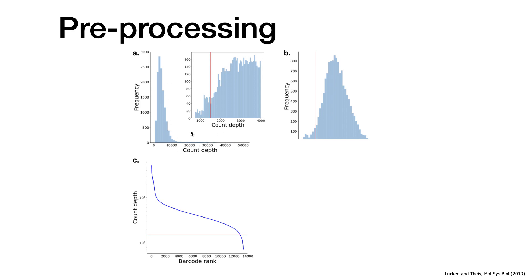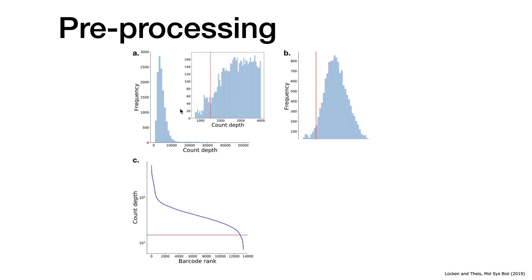You see you have some kind of an upper tail and you also have some lower tail. You can even zoom in, like computationally zoom in, to resolve the lower end regime in order to make an informed decision on where to cut. For some barcodes, you can be really sure if it's a cell or if it's not, but making an exact cut with this kind of method is sometimes difficult.